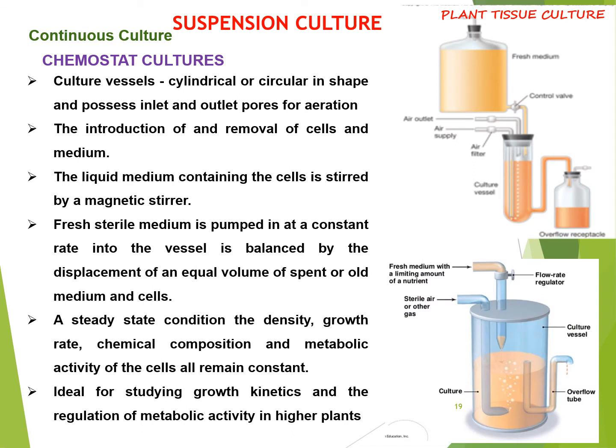Chemostat cultures. These are open type suspension cultures. Here, the culture vessels possess an inlet and an outlet for introduction and removal of nutrient media and cells and also for aeration. The figure on your right shows a chemostat culture.